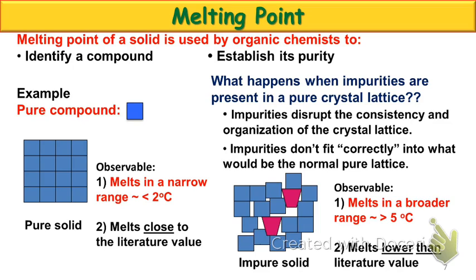Okay? Which is really nice. We can just compare it to a literature value. Okay? The other thing we can do is use it to establish purity. And that's what we're going to talk about here, and that's why we're doing the recrystallization.